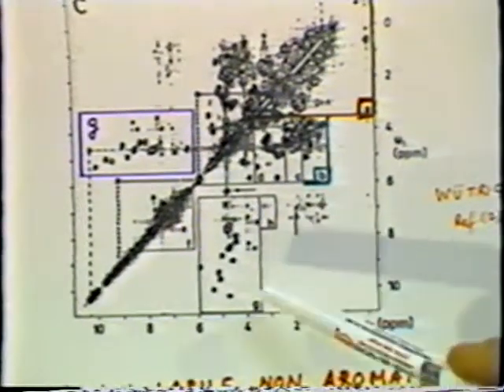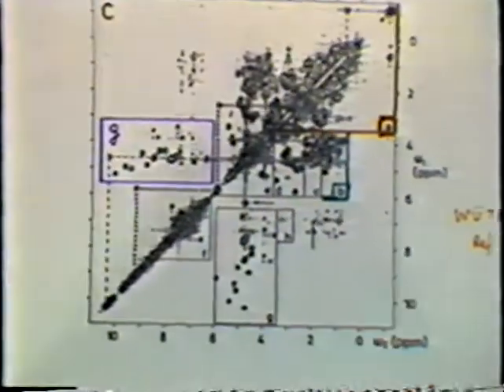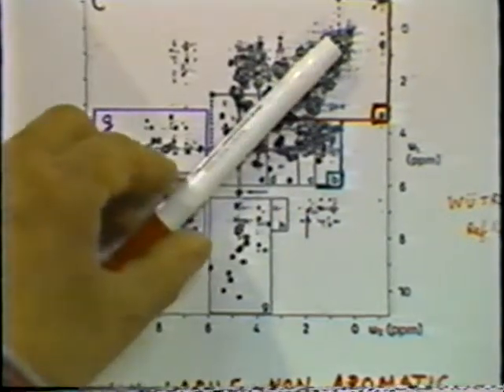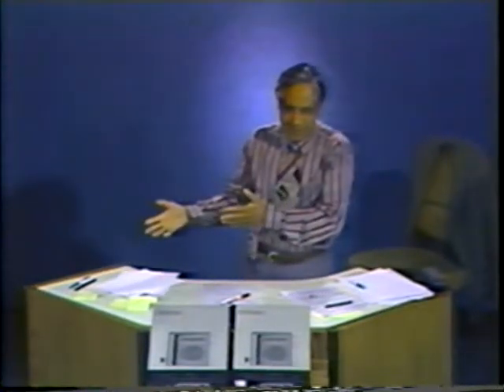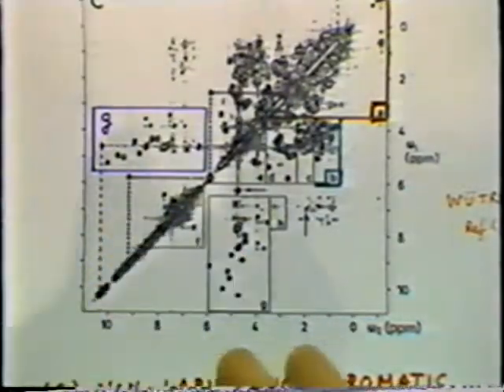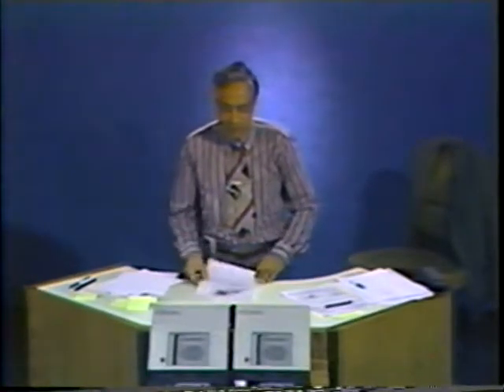The interesting region is the G region. Okay, this is symmetric. I should have said that. This COSY spectrum is always symmetric about the diagonal, because if there is a transfer from spin A to B, there is a corresponding transfer from B to A. Experimentally, it will not look symmetric, because there will be noise and other characteristics, but in its information content, it is symmetric.